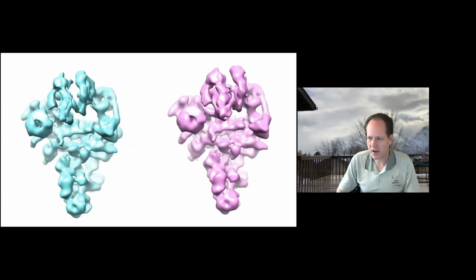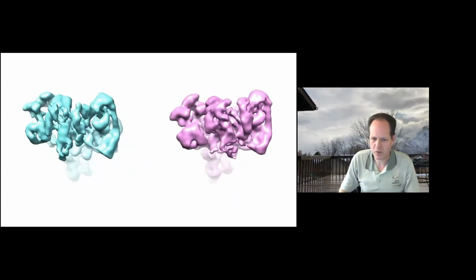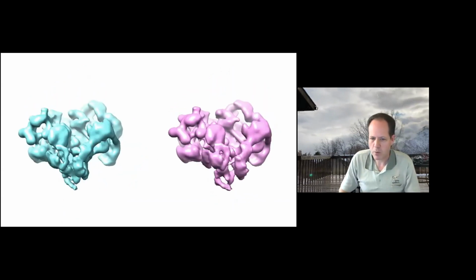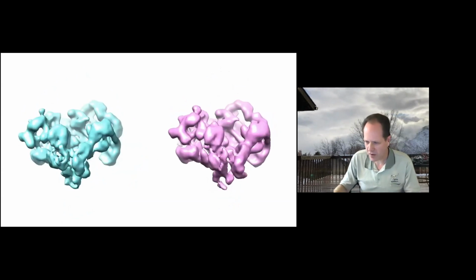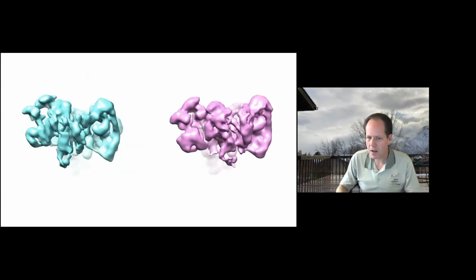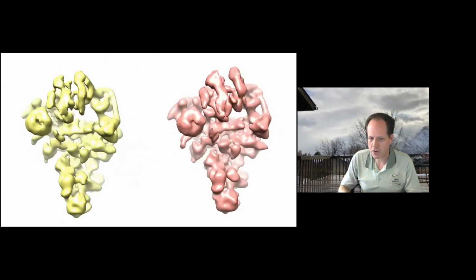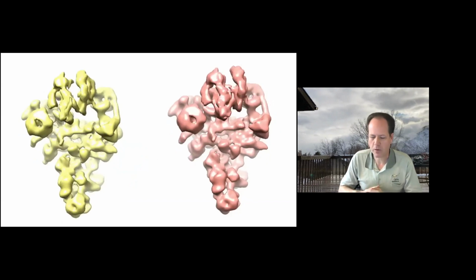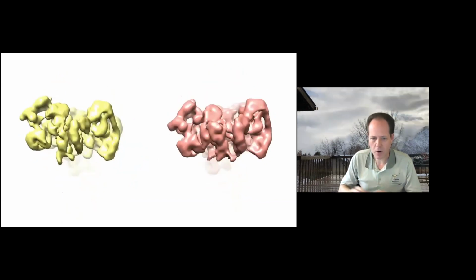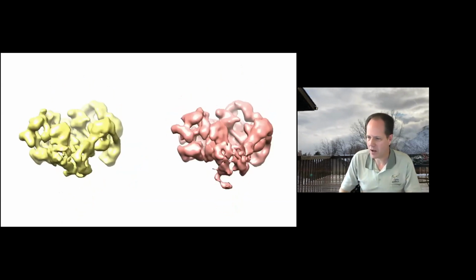You can see these two different rocking motions that exist within the particle. And I would point out that these are not interpolations between two discrete states that we determined from the data. Each of the intermediate structures you see here were generated as averages of real particles that were present in the data. So these aren't made up intermediate states. These are actual real states that were observed among the particles in this data set.